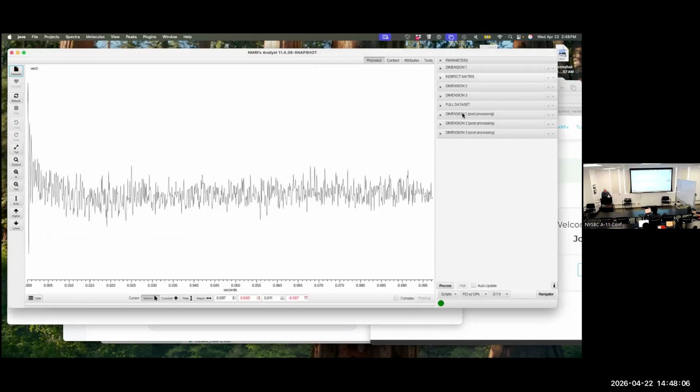then I open up the FID. 3D experiments and more, I should probably be more aggressive about this, so to speak. I don't automatically set up a processing script because I have less confidence that I'll get them right. But typically, if you go to the scripts menu and say auto generate, it will try to automatically generate a script. And that's usually pretty good.